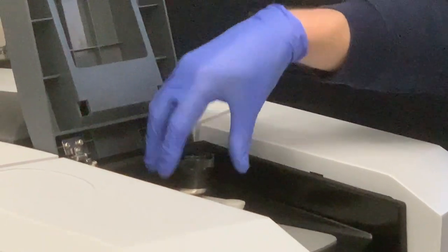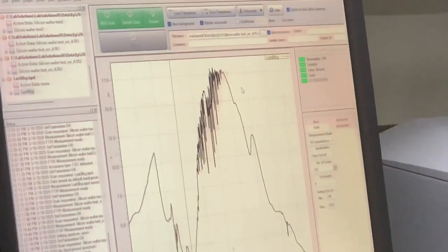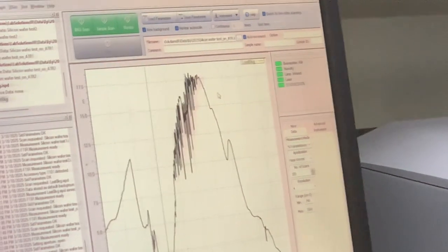Because you have something like this, you don't really need to clean the ATR, but if you guys did move over to powders or something, just make sure that you're cleaning the surface of the ATR in between runs. It was IPA or acetone? IPA and a chem wipe. And don't spray it directly on the crystal. Put it on the chem wipe. Exactly.